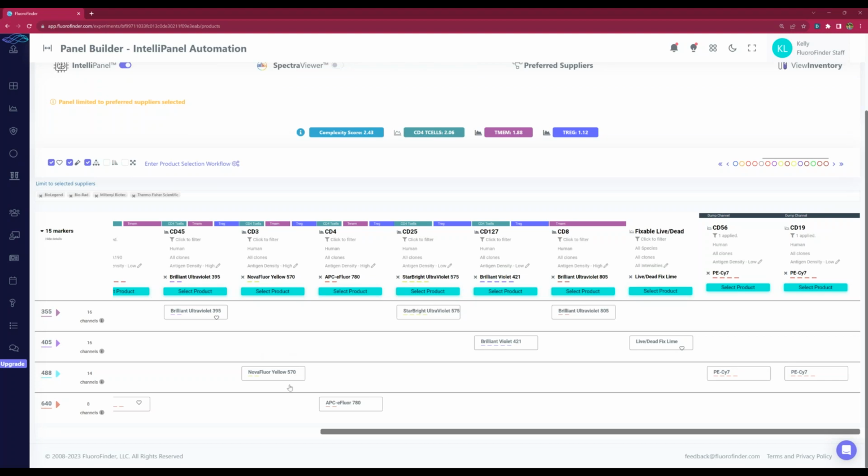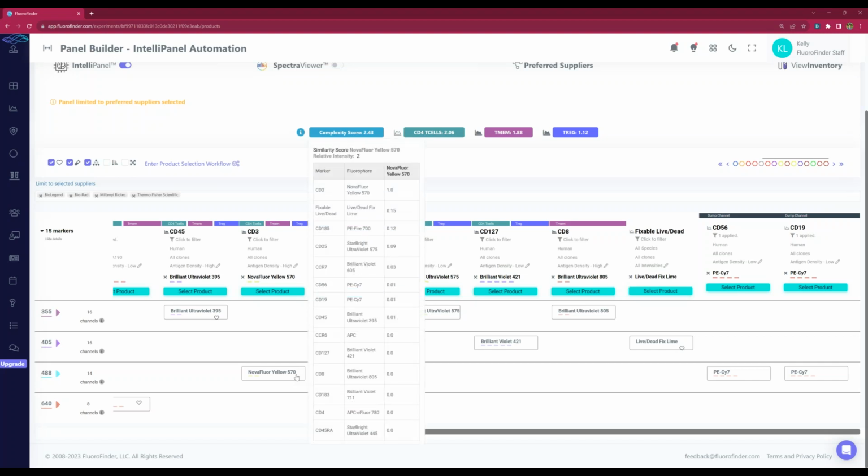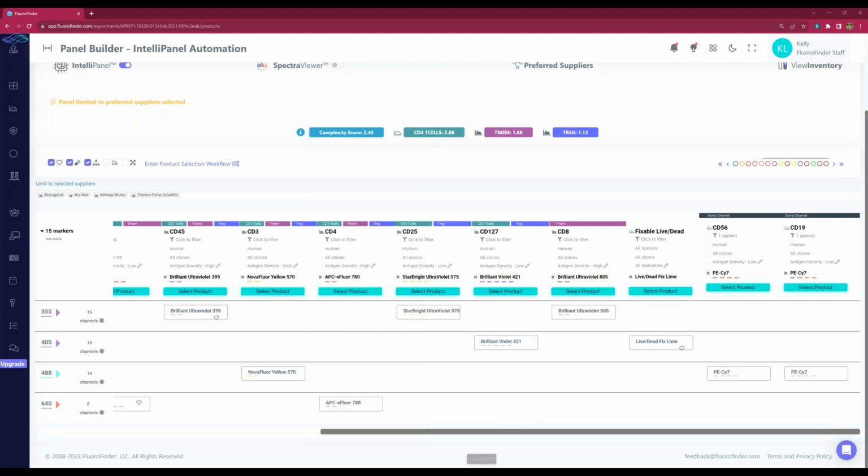I've already talked about a lot of the things that are used in the background to make these choices, but what's also important is that I have given weight as an expert in fluorescence applications. I, for example, will let it show you Alexa 700, but it is a fluor that's behind the times. There are alternatives like R700 or R718, or one of my favorites, NovaFluor Red 710.